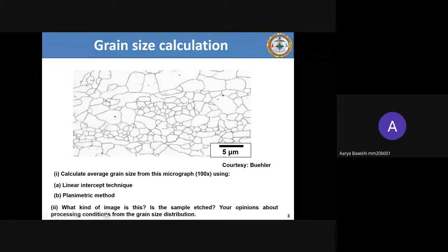Sir, how do we make out whether this is a coarse grain? See, look at the microstructure. Look at this grain where my mouse is pointing, the adjacent grain, and the top grain. What will be your opinion? Is this grain coarse or this grain coarse? The upper grain is coarse, in terms of size, right? Yes. Certain regions are fine, certain regions are coarse, which means recrystallization has started happening in the coarse region, and in the fine region there might not be recrystallization at all.